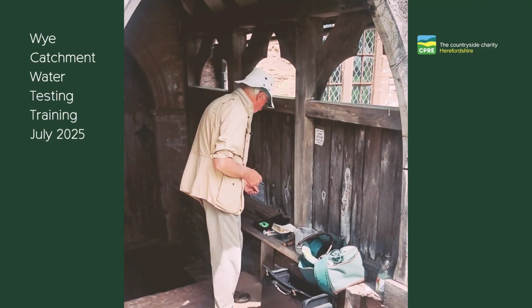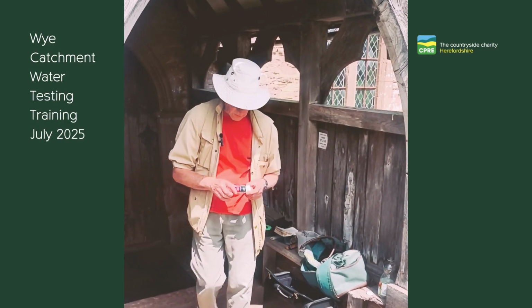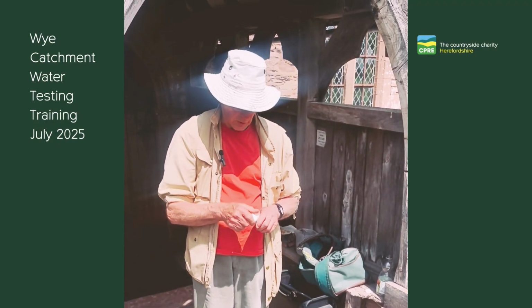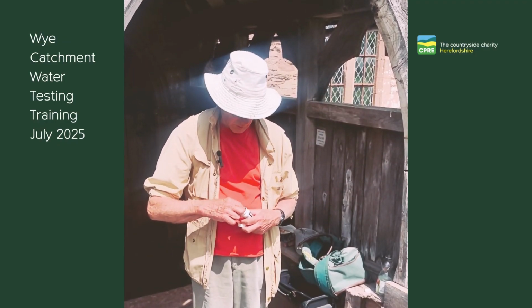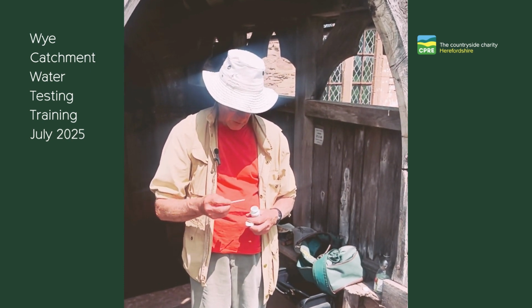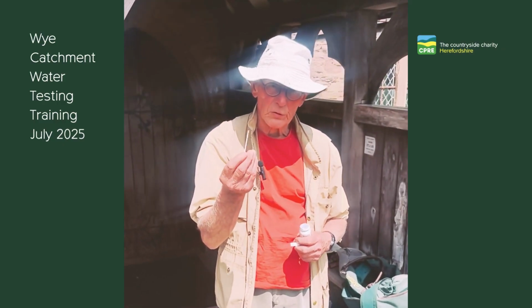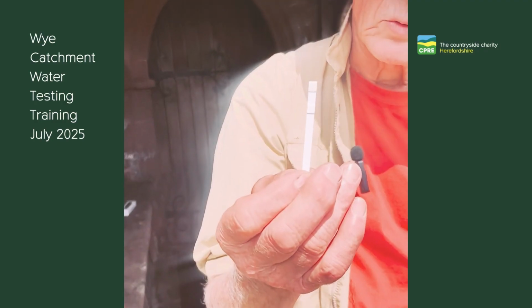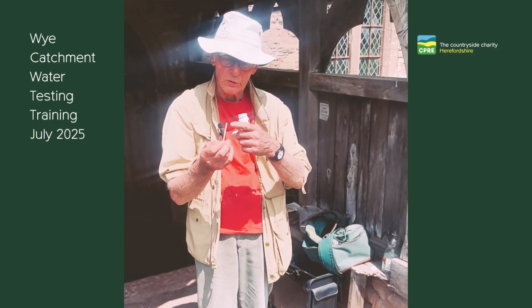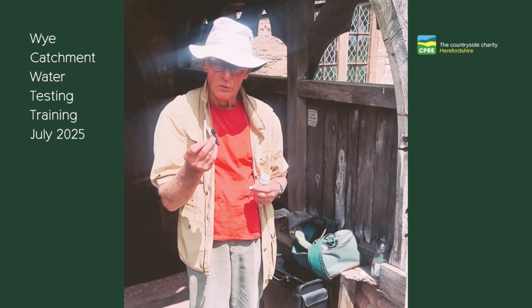The next one we're to cover is nitrates, and this test involves the use of nitrate strips, which come in a little tube like this. Each tube contains 25 strips. So those will keep you going on one site for about 6 months. Each strip has 2 tabs on it. It's important not to touch the tabs when you take them out of the tube. The one that's of interest to us is the top tab, which is measuring nitrates. This one is for nitrites, which are not of interest to us.